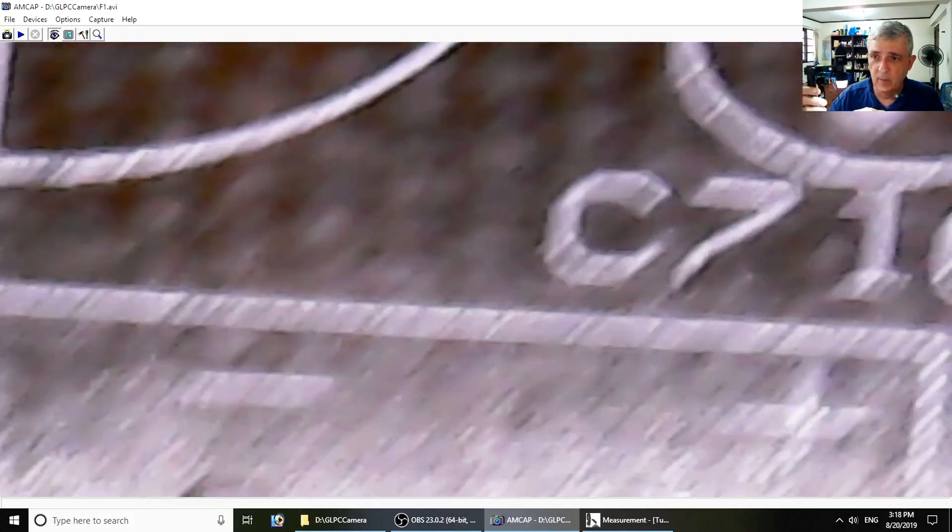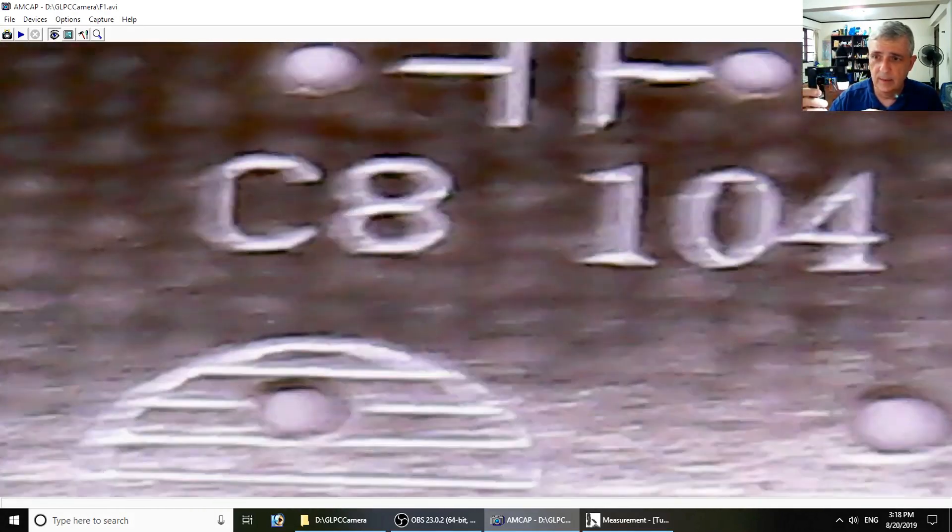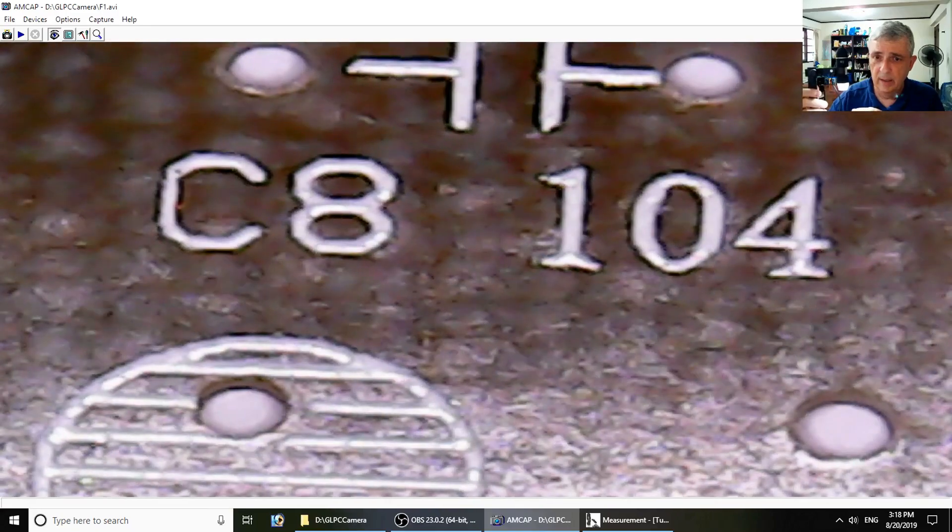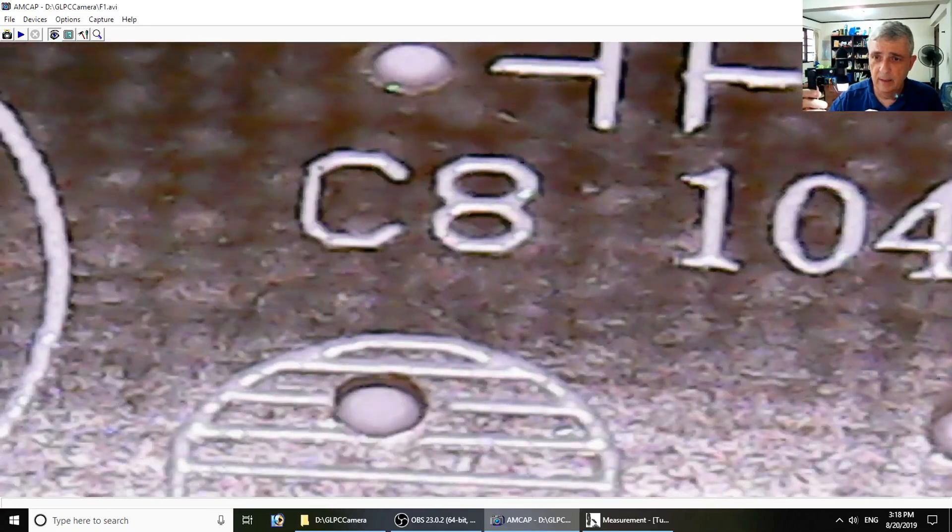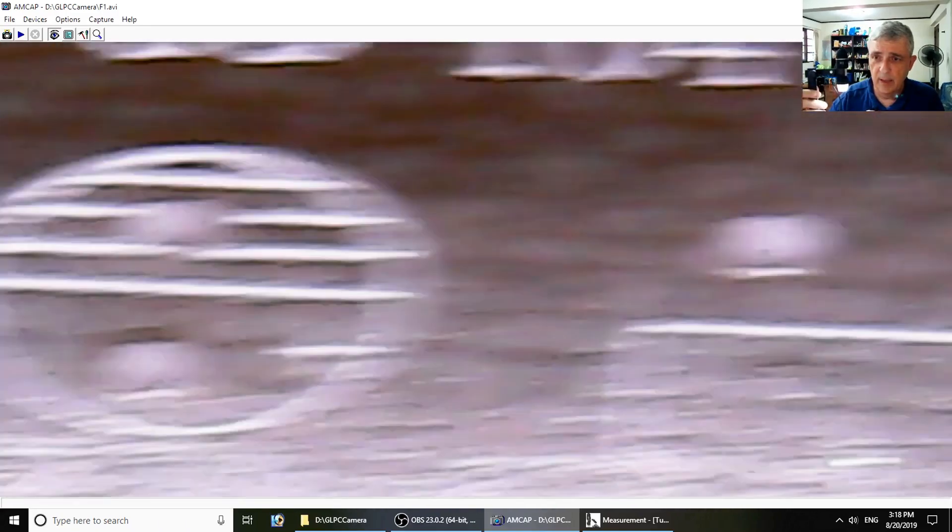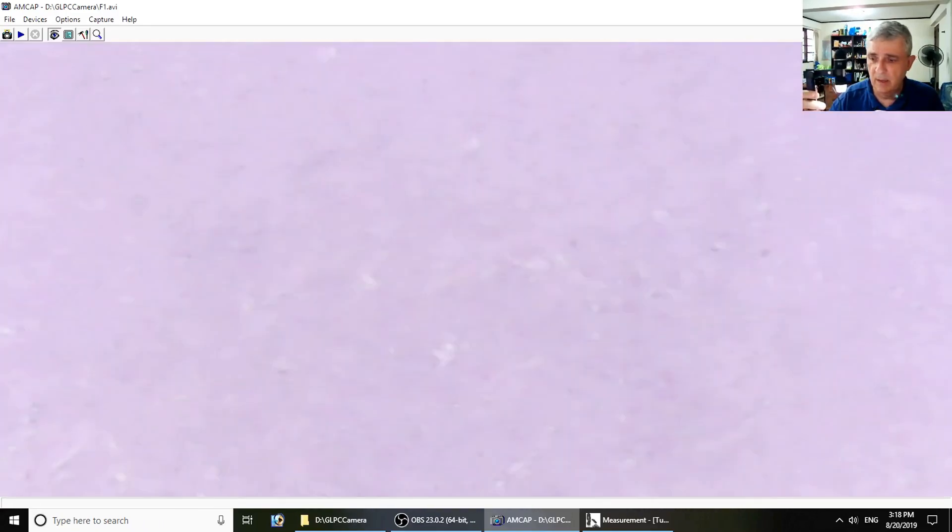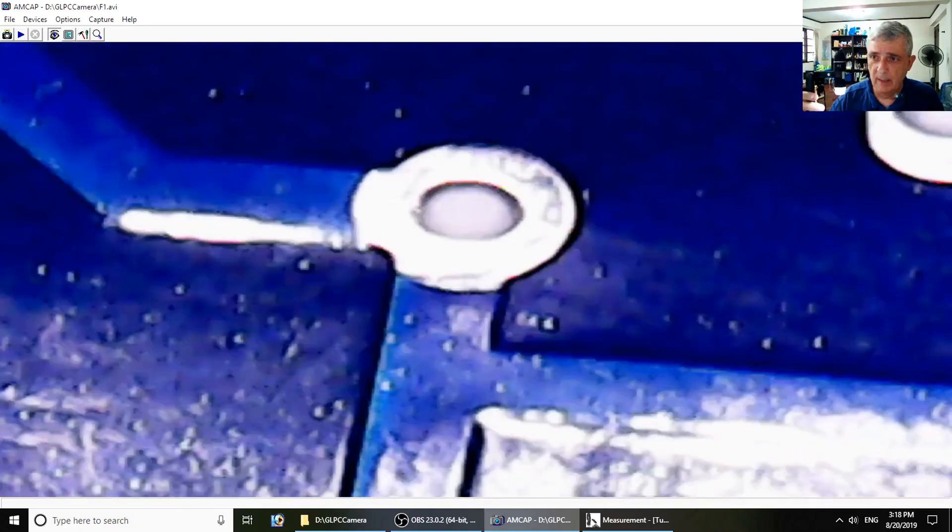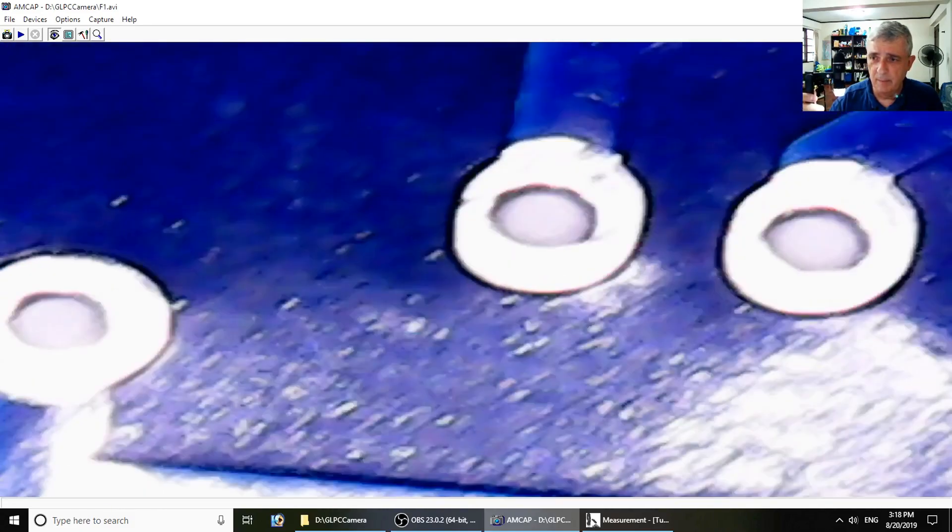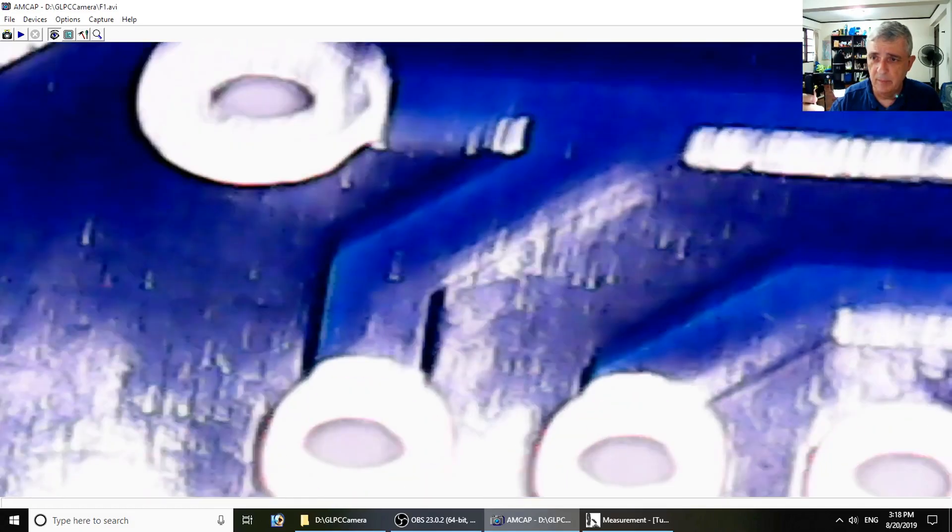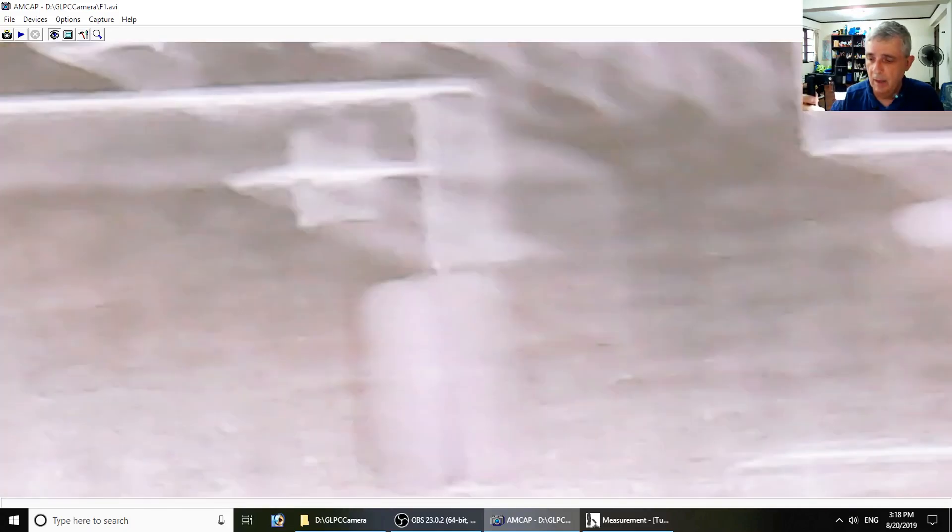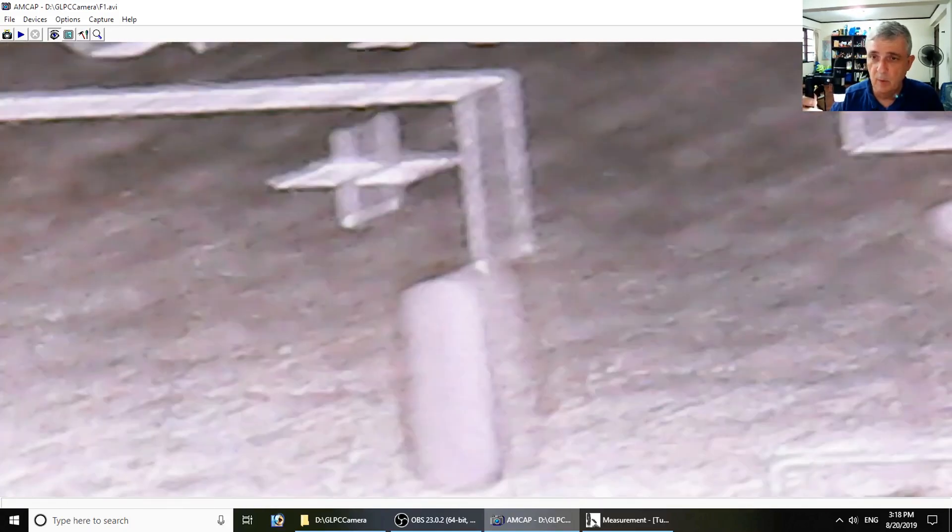You can examine that pretty carefully, flip it over, take a look on the back side. The color rendition is not great, but it's adequate. This side is probably more interesting.